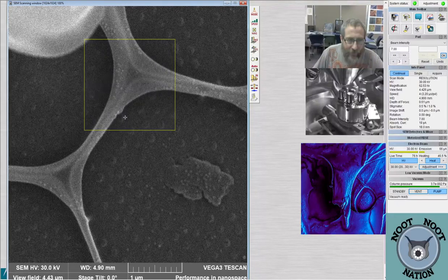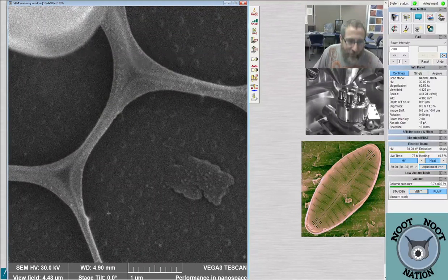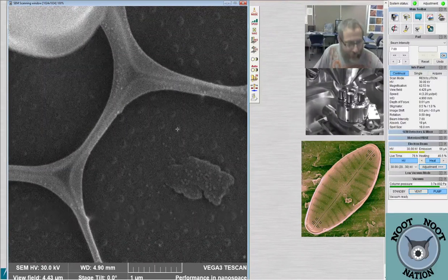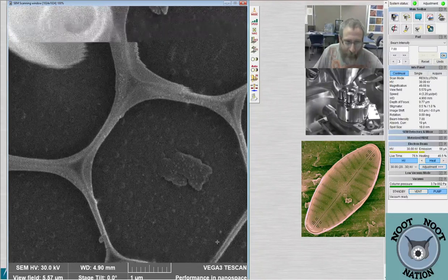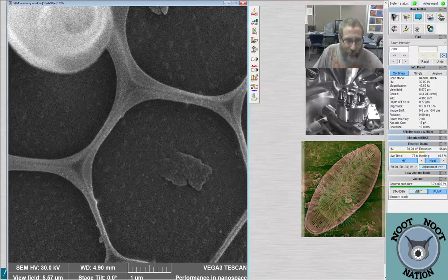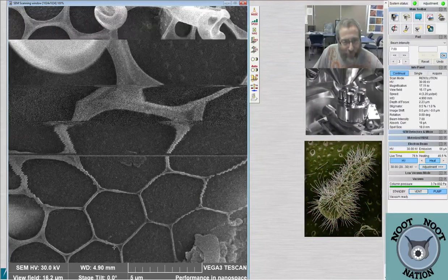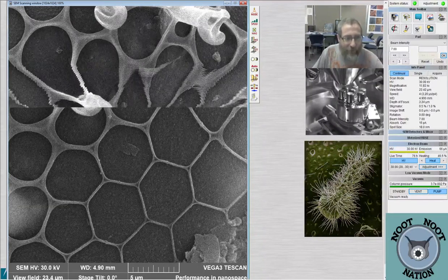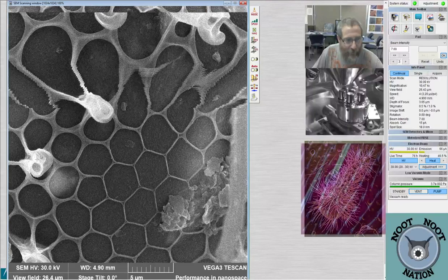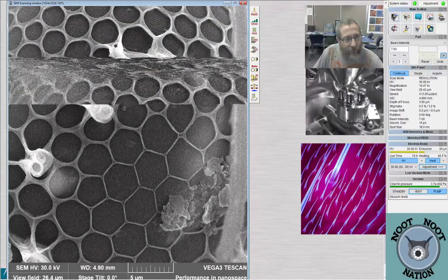Sorry, I'm just trying to get this perfectly in focus as I usually do. I don't think you can actually resolve these little holes any better, but of course it's a diatom, so here are the little holes associated with letting the nutrients in, and then this weird superstructure over top of it, like Epcot Center. We're zoomed in so close you can't really even see those spines we were talking about, but these are the spines coming off of the valve face right here.